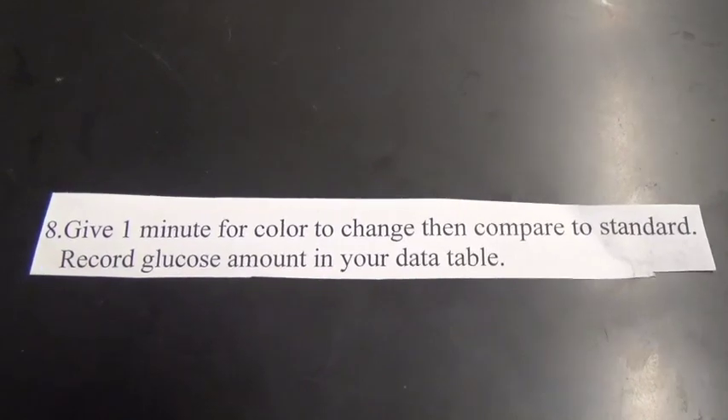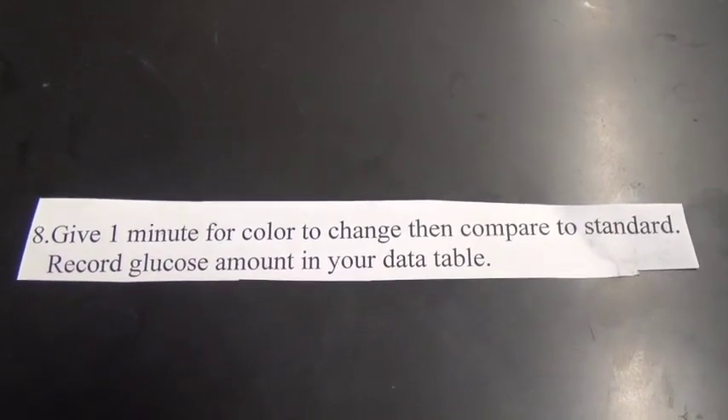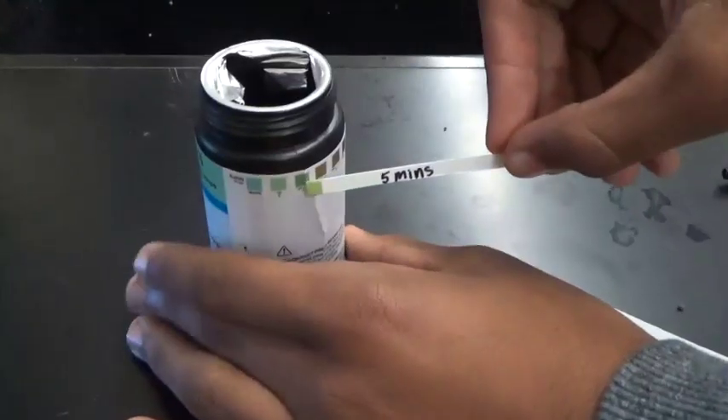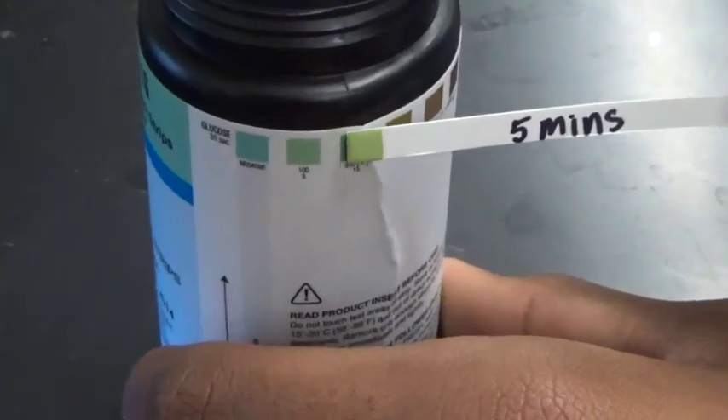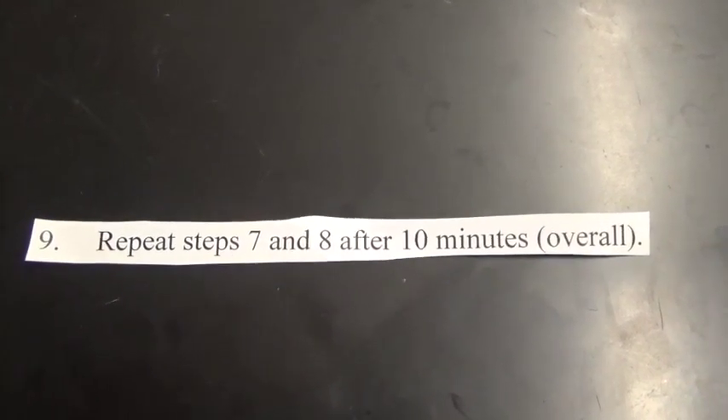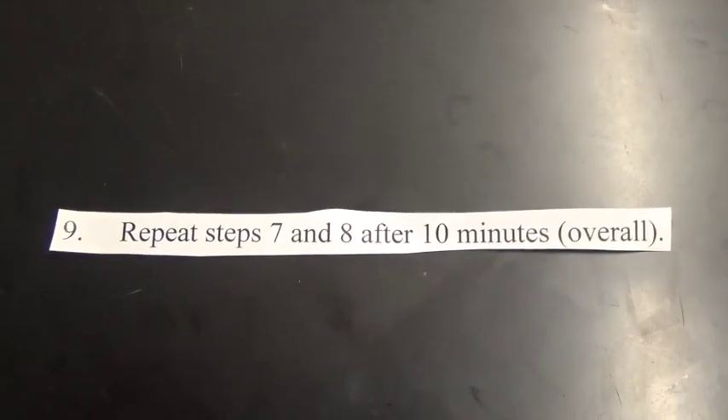Number eight. Give one minute for color to change, then compare to standard. Record glucose amount in your data table. Number nine. Repeat steps seven and eight after 10 minutes overall.